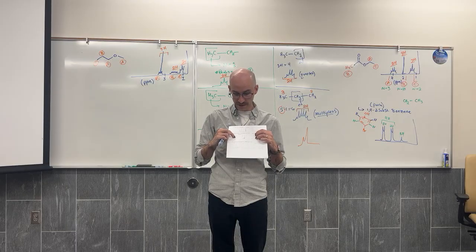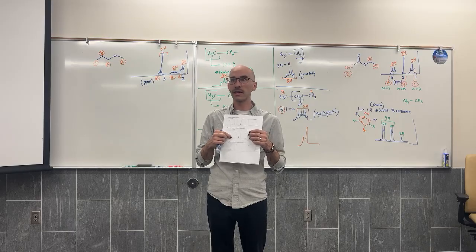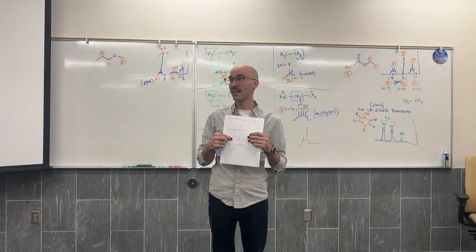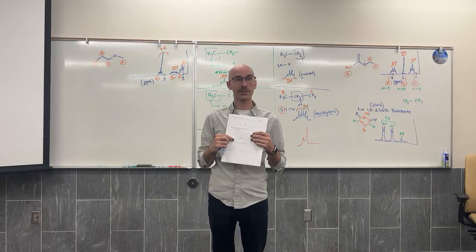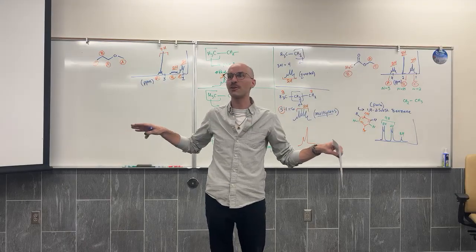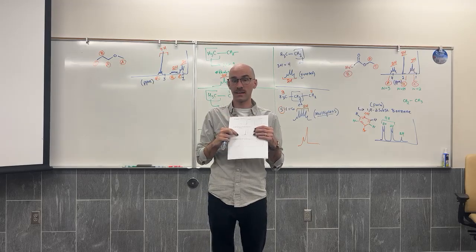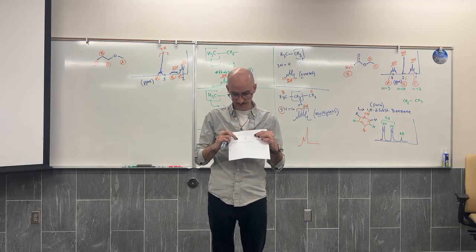So I should expect to see something in the vinylic region. Oh, I do, 5.4 ppm. I see a vinylic hydrogen. I can assign that hydrogen to its spectrum. Even if I can't assign anything else because it's too cluttered, I can at least find a unique thing to assign.